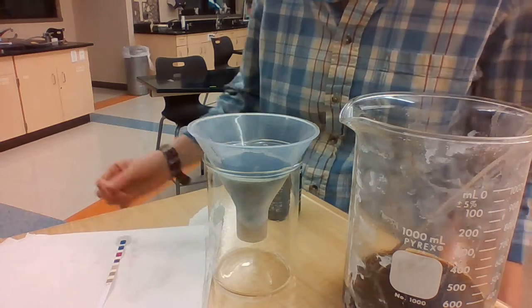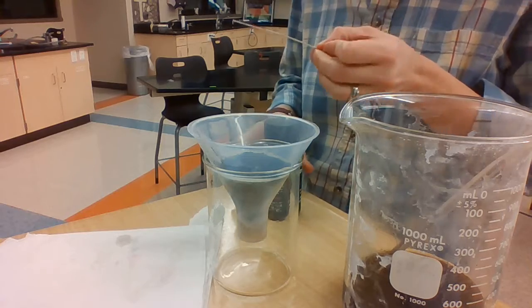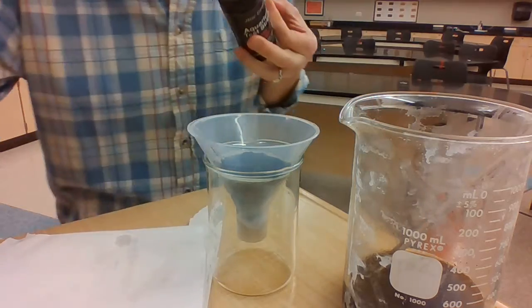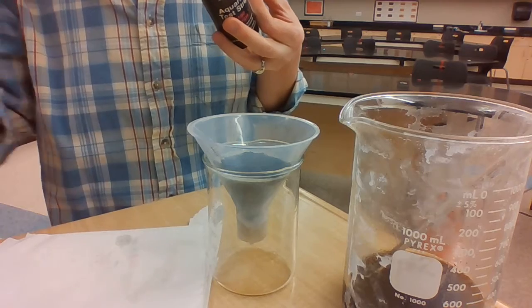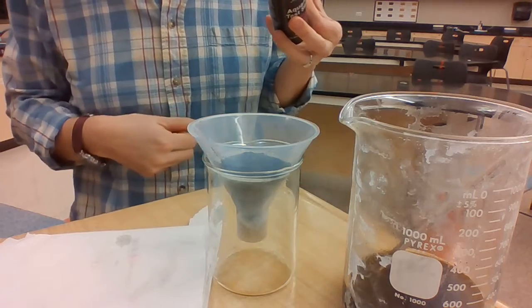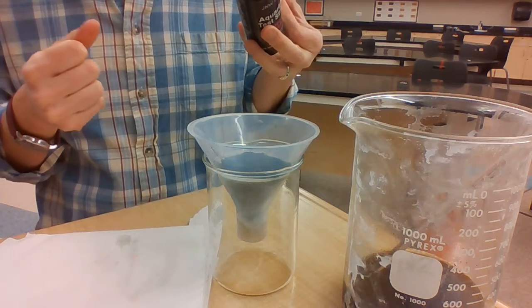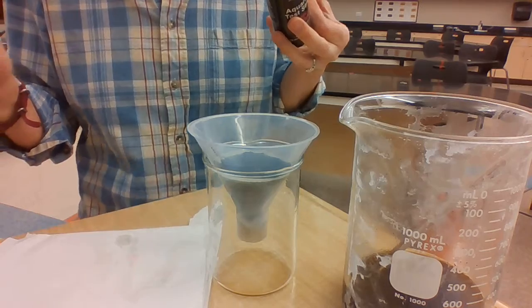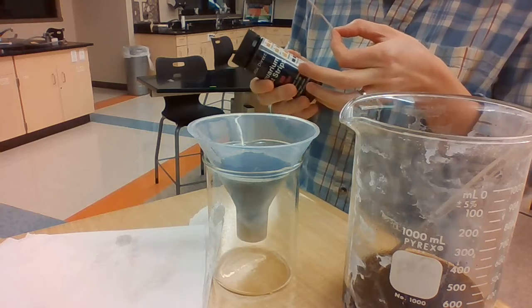Okay, so now I'm back, and you can see that the water is dripping through my filter into the beaker, and I've got my test strip from my contaminated water here. I'm going to use it to tell you the different levels that you're going to record in your table. If you haven't opened your table yet, make sure you load the lab and describe the contaminated water: dark brown or black, I don't know how it appears in the video, and not see-through. Then we're going to put the values of the 6 contaminants in the data table, and you're going to compare it to your contaminant notes to figure out if those are safe levels of those chemicals.